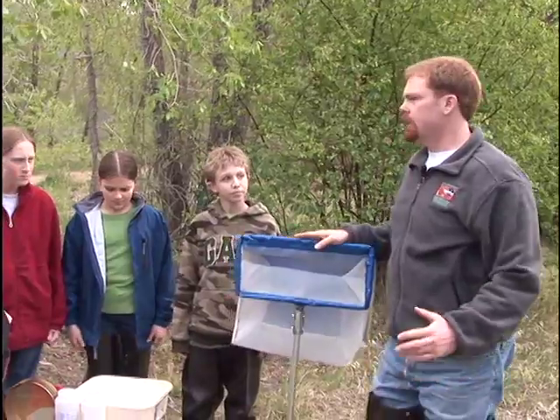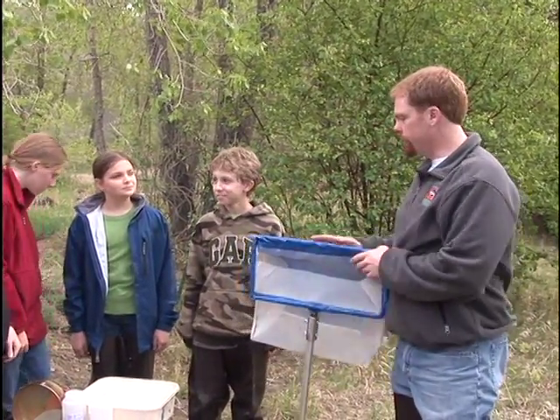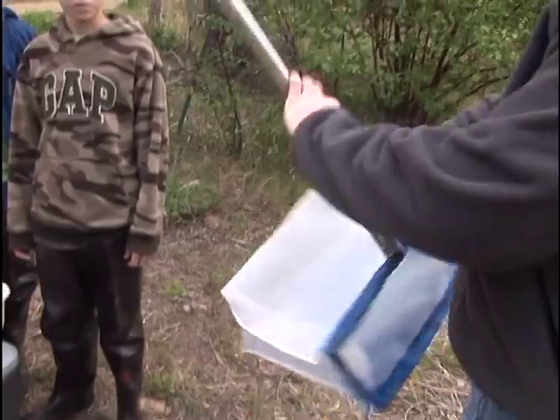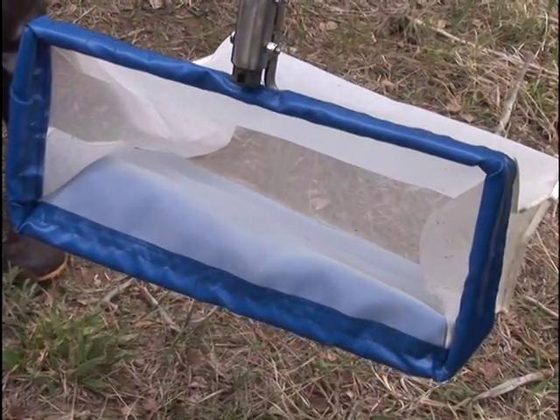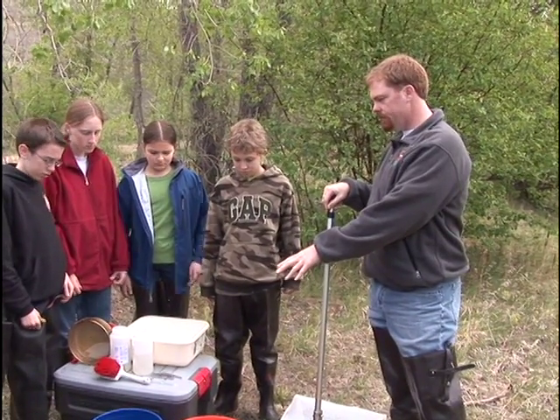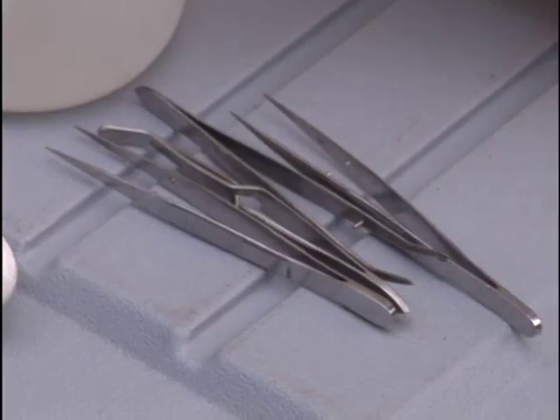All right, guys, let's talk a little bit about the equipment that we need to sample macroinvertebrates. Most important, we need our net, okay? This is called a modified D net. We're also gonna need 2 different buckets, a brush, tweezers, a tub.